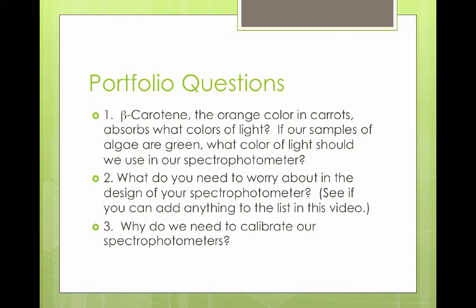Number two, what do you need to worry about in the design of your spectrophotometer? See if you can come up with anything that is in addition to the list that we'll talk about in this video. Number three, why do we need to calibrate our spectrophotometers?